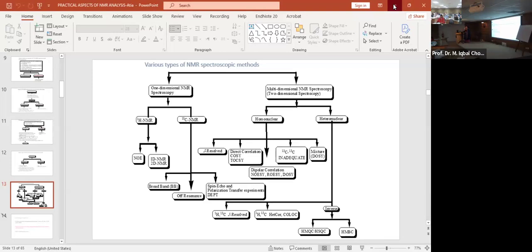And whatever is read by Nova, this is another third-party software, so I don't know. Whatever is written in Bruker, I myself always use TopSpin for analysis and everything. I never used Mestrenova, but whatever you see in the spectrum is the one that your nuclei faced in TopSpin from Bruker. This is the same software which we use to run the experiment.